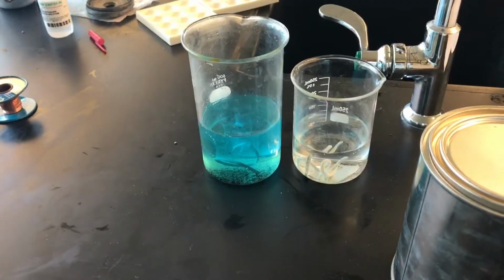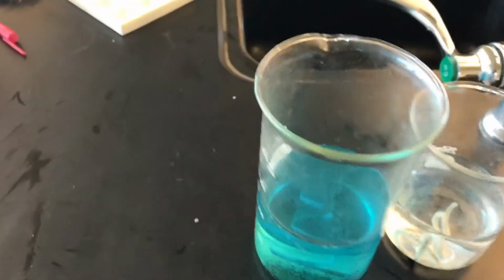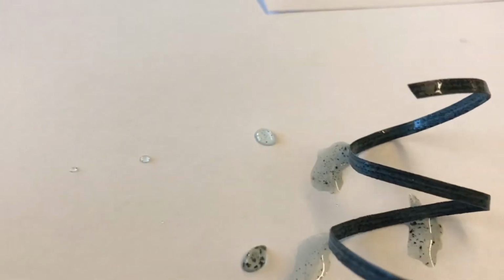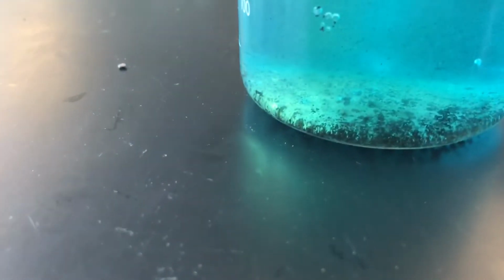All right, so now that the reaction is slowing down, I'm going to take both of our substances out so that you can see what they look like now. And so this was our magnesium ribbon. And now take a look at its coloration, and you can even see the little particles that have been in the process of coming off.